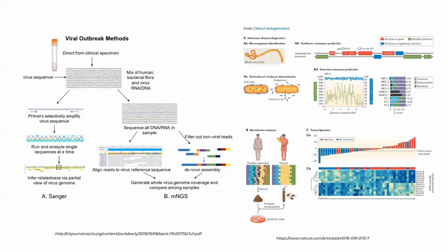And you can see here a couple of examples where typically you have a clinical specimen, you use specific types of primers to amplify those sequences and map those sequences onto known viral genomes, for example, databases of viral genomes, or potentially look for specific types of sequences that align to databases of known genome or of known genes, of viral genes, and an ability to also eliminate host genes from whatever we find.